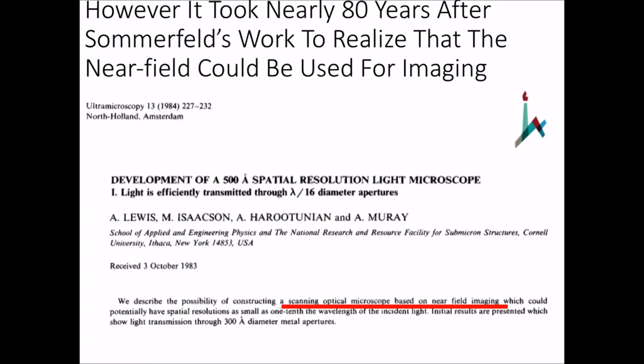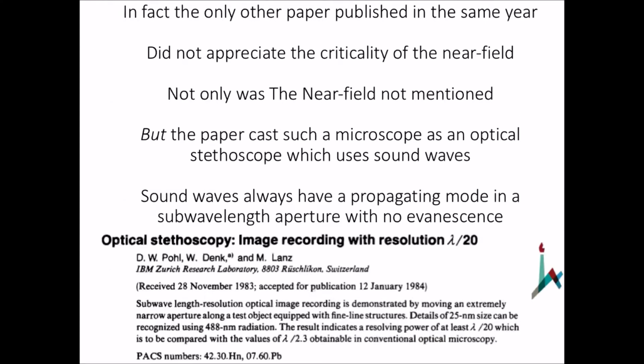So this paper was written. We predicted correctly what the resolution limit would be for such a type of microscope. It would be 50 nanometers. And no one has ever beaten that for this type of microscope. And really, we were very close to the exact number.